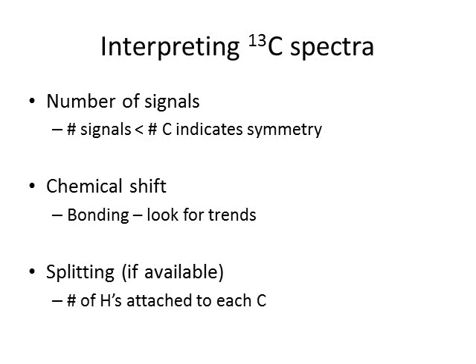So, for instance, sp3 hybridized carbons will give you signals somewhere between 0 and 70, plus or minus, depending. But a pure alkane, just C-H, C-C type bonds, will have those signals more to the right within that 0 to 70 region.